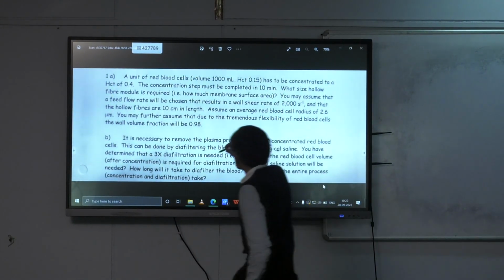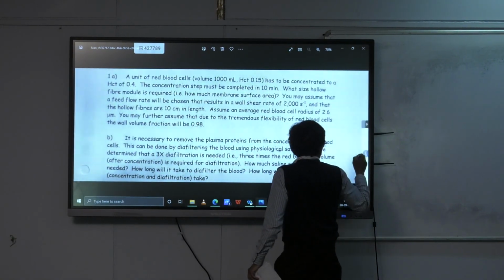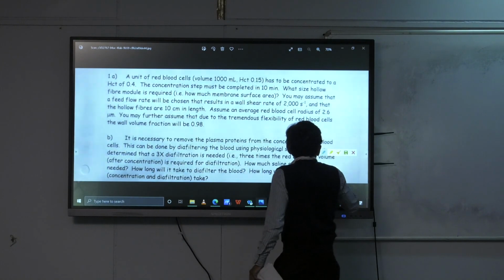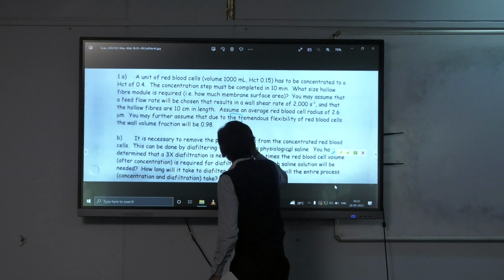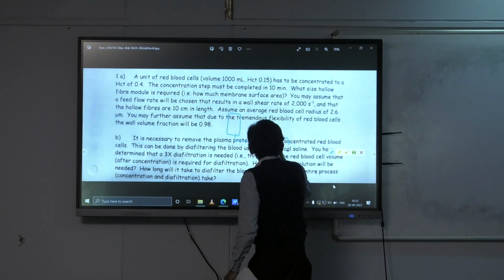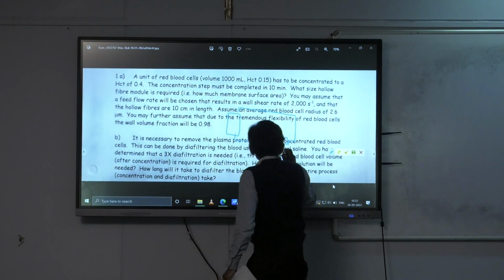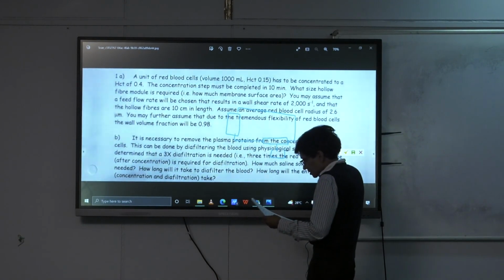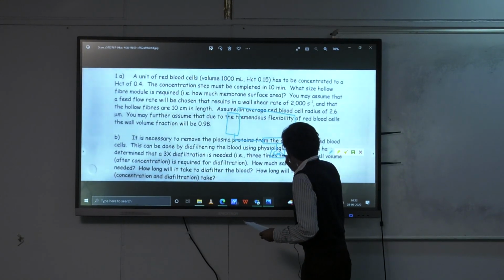So remember, we have this so far. We have a blood bag here, right? We have something coming out here. We're going through our module. We have retentate coming back in here. And we collected our permeate, whatever it was, 625 ml. So we have 625 ml here already.